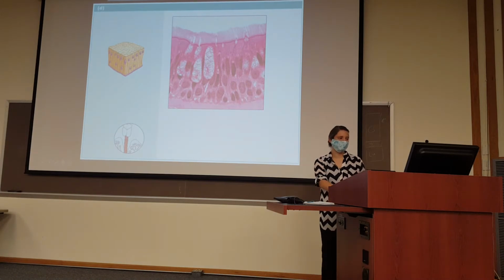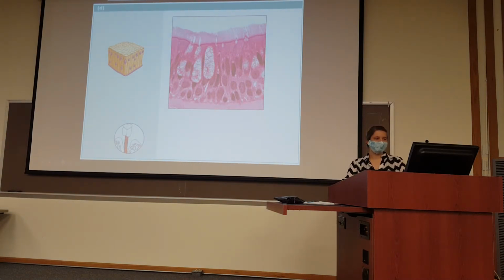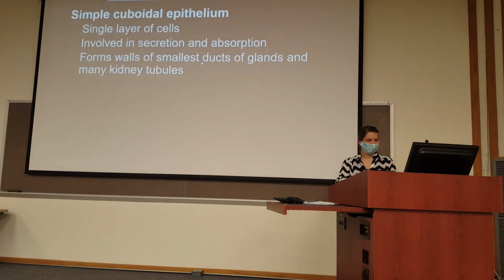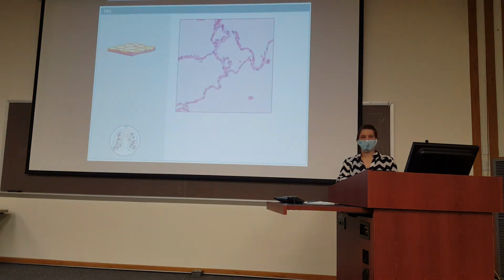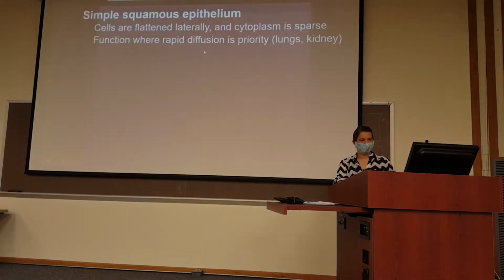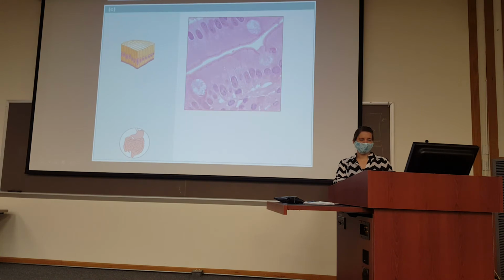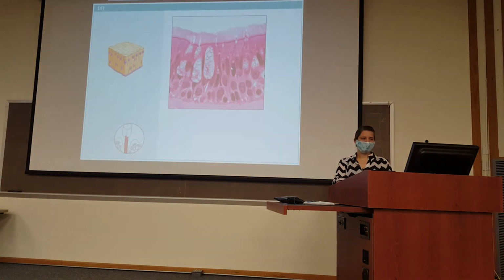Sneaky, tricky question because I like being sneaky and tricky. What the heck is this? Only one layer thick, right? Sort of, technically. But does it look weird, like back here? These cells all pretty much look the same, right? They're called the same kind of cells. These ones are all these nice chubby little guys. These ones are these really tall cells. This one? So yeah, there's only like one cell here in this layer, but what is happening?